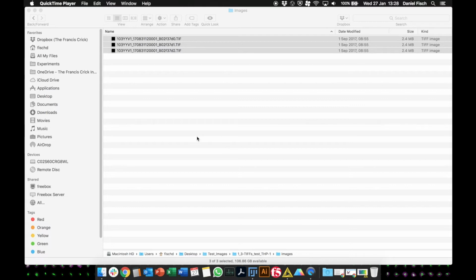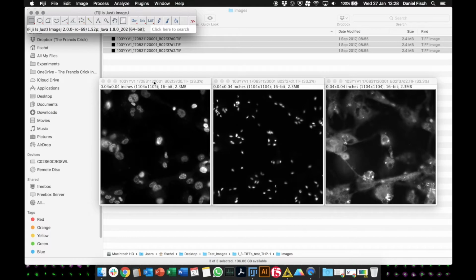For the purpose of this tutorial, I'm just gonna use 3 example images that I have here in my folder, organized in a channel-wise fashion, meaning that I first have channel 1, 2, 3, and I would then have different fields or wells of a multi-well plate. The images that we're going to be running are, as I said, from 3 channels. So we have the nuclei stained with a DNA dye, we have the cells infected with fluorescent Toxoplasma gondii, and in the 3rd channel we have the cells stained with ubiquitin.